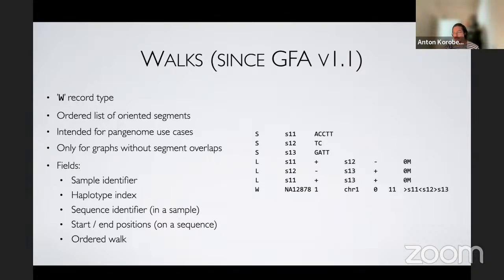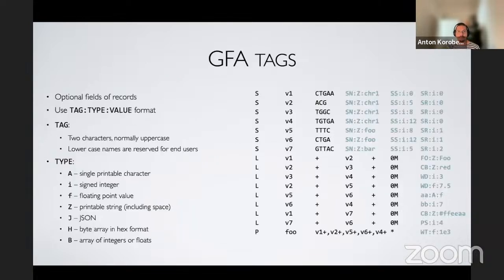So yeah, the format is pretty straightforward. It can even be modified by hand, and you could use all the text processing utilities to even operate on the assembly graph, like drop the paths or find a link or whatever, and even extract a subgraph if necessary.